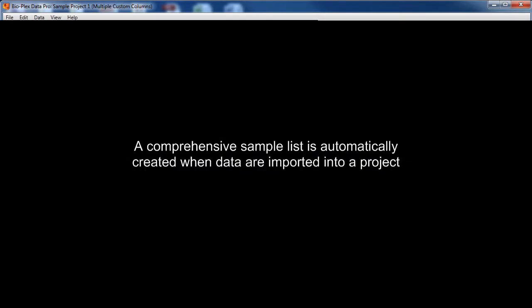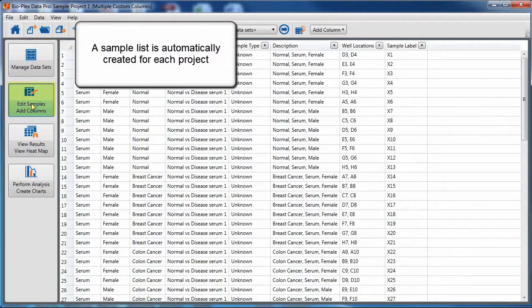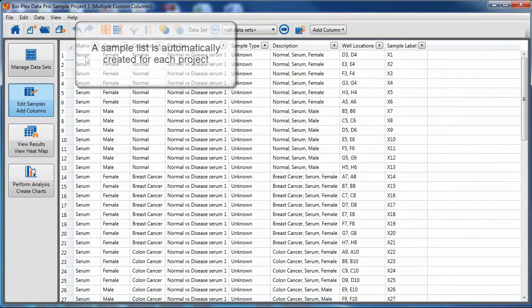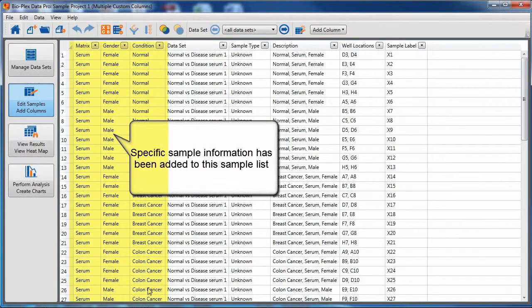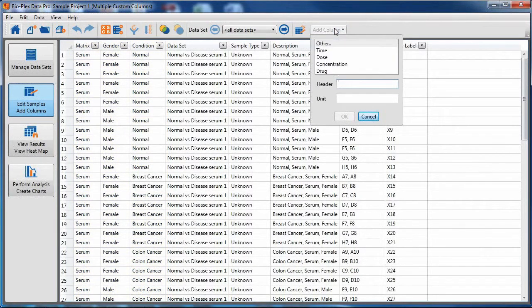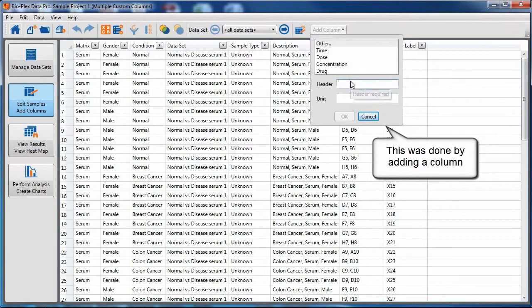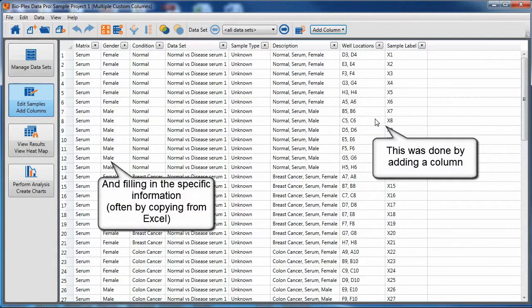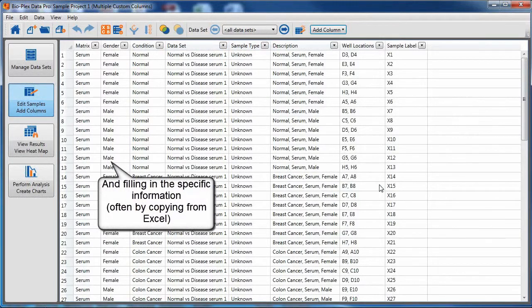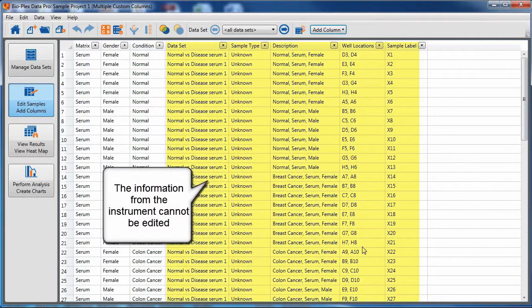A comprehensive sample list is automatically created when data is imported into a project. Specific sample information has been added to this sample list. This was done using the add column function shown on the right. Information was then filled in by hand or from copying from Excel.